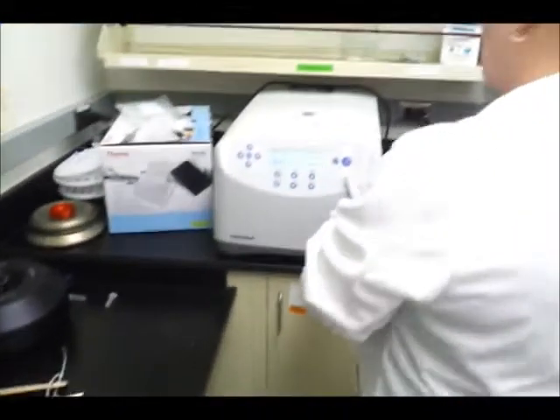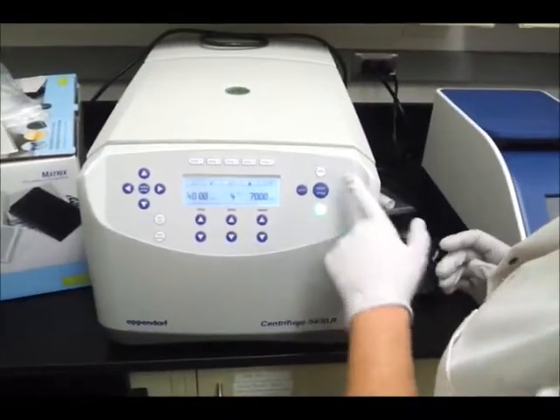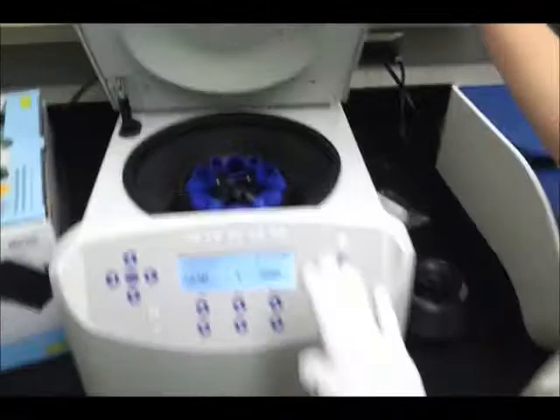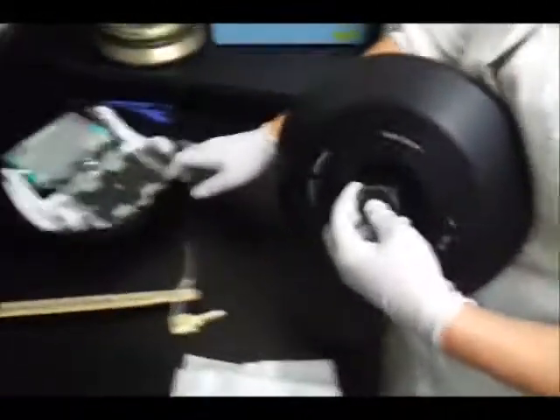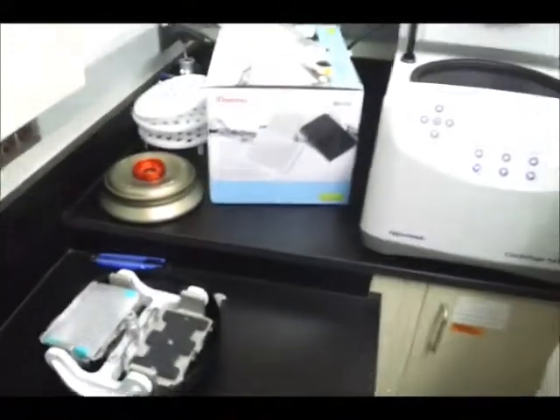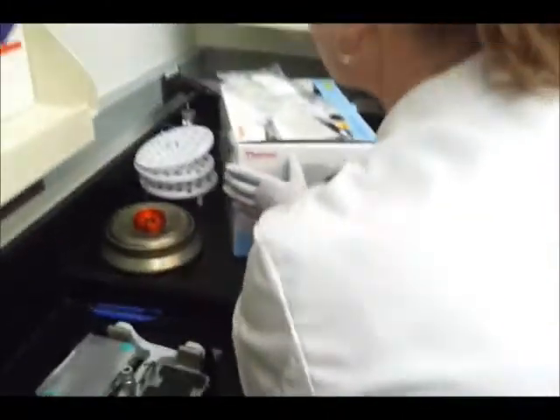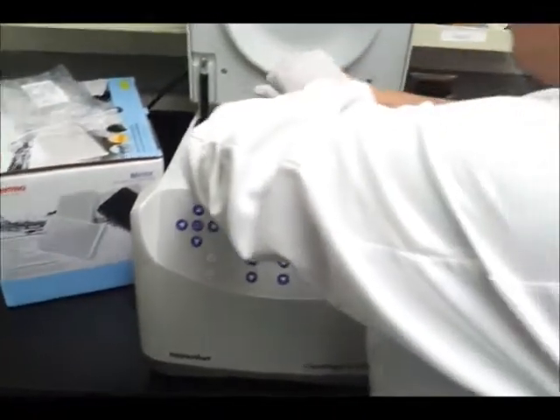Turn on the centrifuge, and then I'm going to see what rotor is in there. So it's a different rotor, so we have to change the rotor. And it's this guy that we'll put in there. So there is a screwdriver. Oh, it's that. Oh, it's that cool looking one. Oh, this thing. So you loosen this one up.